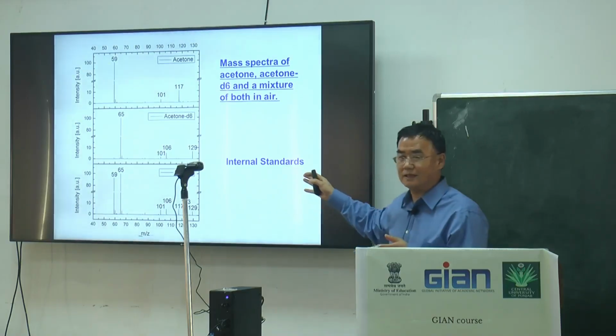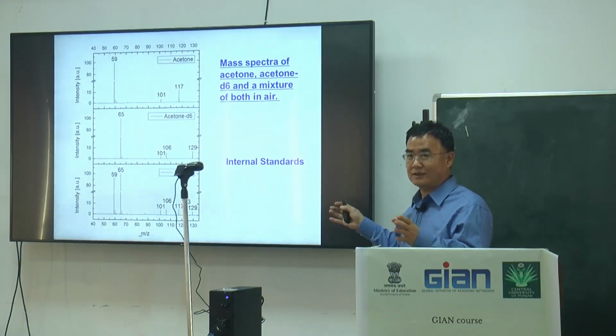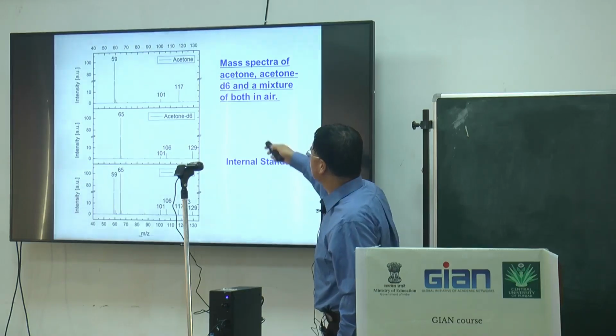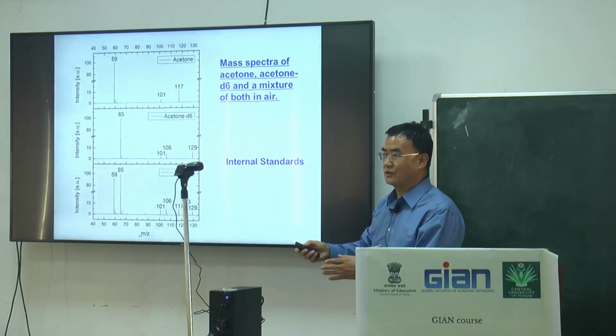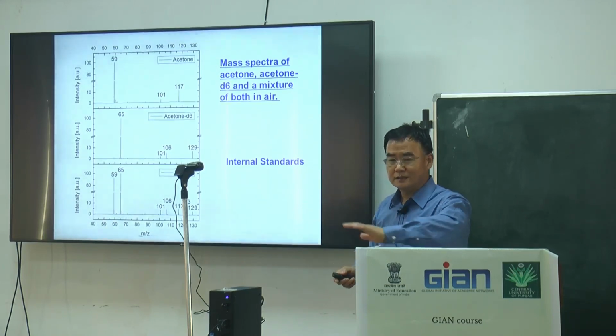For LCMS or GCMS, this is very common. So this is just a comparison of how we identify the real molecules or do the internal standard.